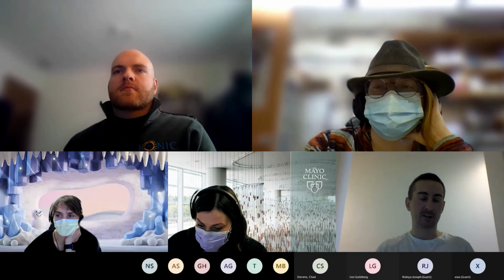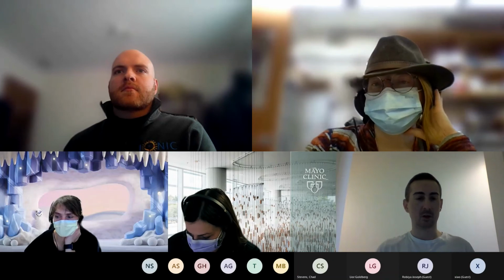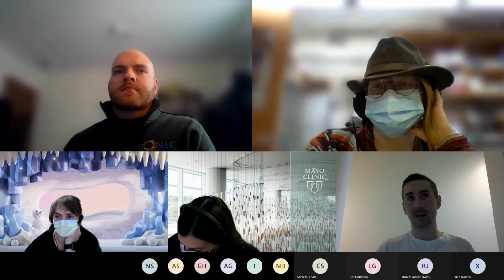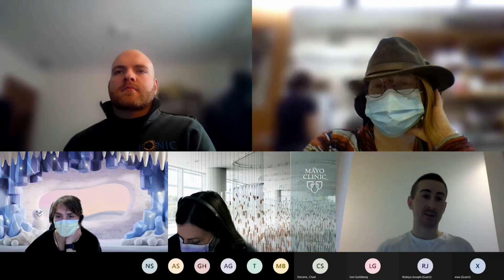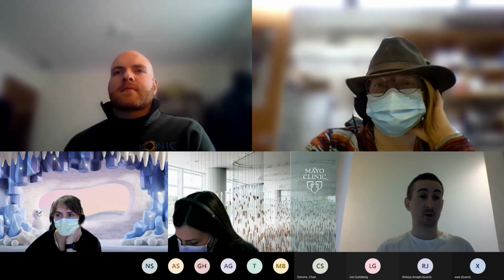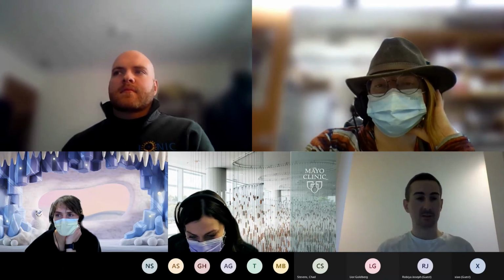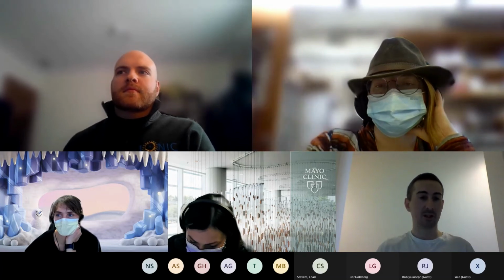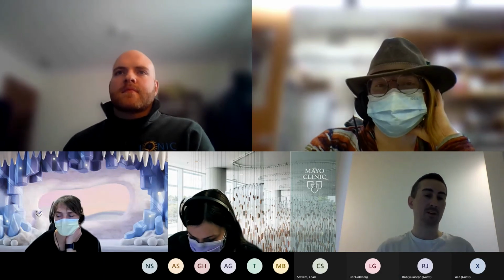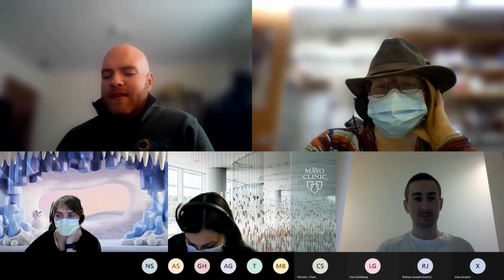We've not experimented with increased or lower concentrations of formaldehyde. I think the final concentration of formaldehyde is 4%, so the samples are stored in 4% formaldehyde, which in our experience is more than sufficient to fix platelets. Platelets, we typically fix with 1%, and that's good enough. Okay, yeah, that makes sense.